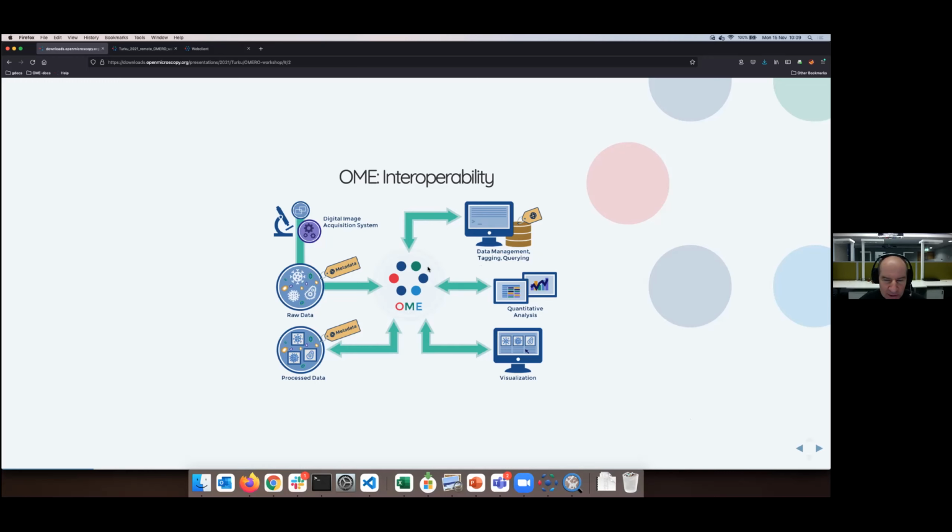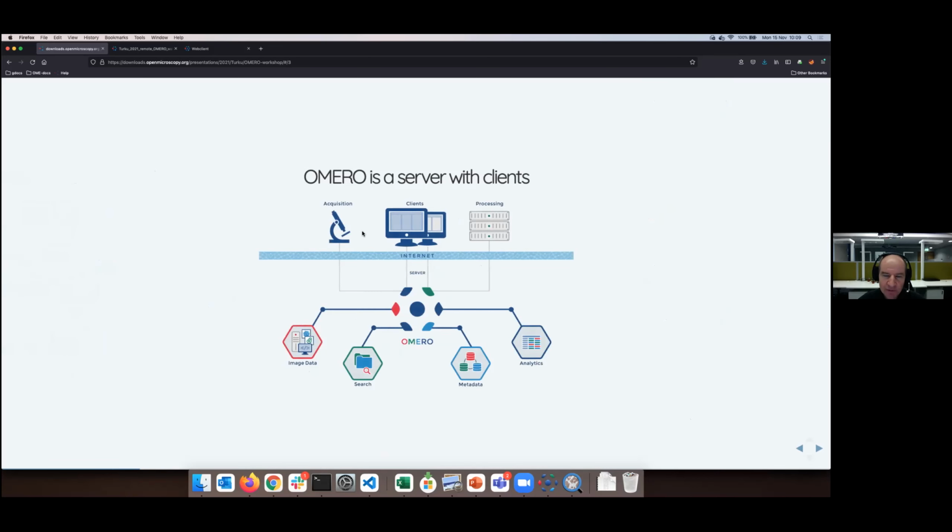Nevertheless, the Open Microscopy Environment produces real software. I also had questions, and then they understood that we are just a loose conglomerate of others. No, this is not true. We have some products, and one of those products, which aims to serve the purpose I just highlighted, is OMERO, and that's the product. So OME is basically a project, a bunch of people who are trying to achieve some goal. OMERO is their product, their software which serves them to achieve that goal, serves them and mainly the community.